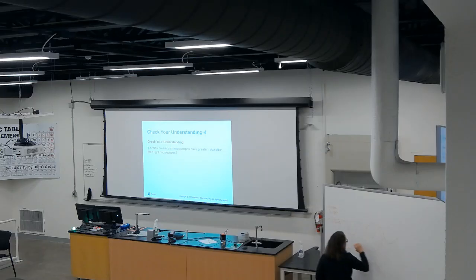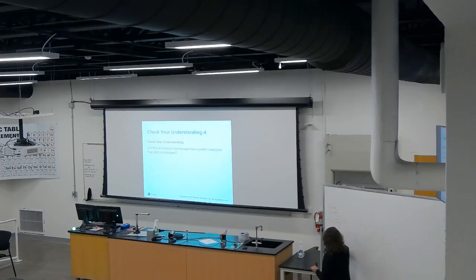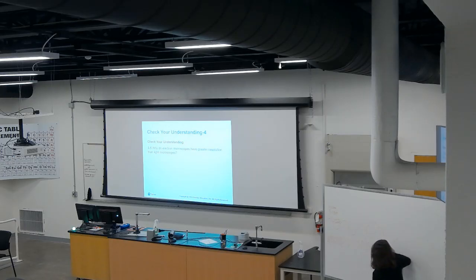Then this object, as it's being hit with these waves of light, you won't have as much resolution as if you have UV light or electrons that have more energy, and that gives you better resolution. So this is shorter wavelength.